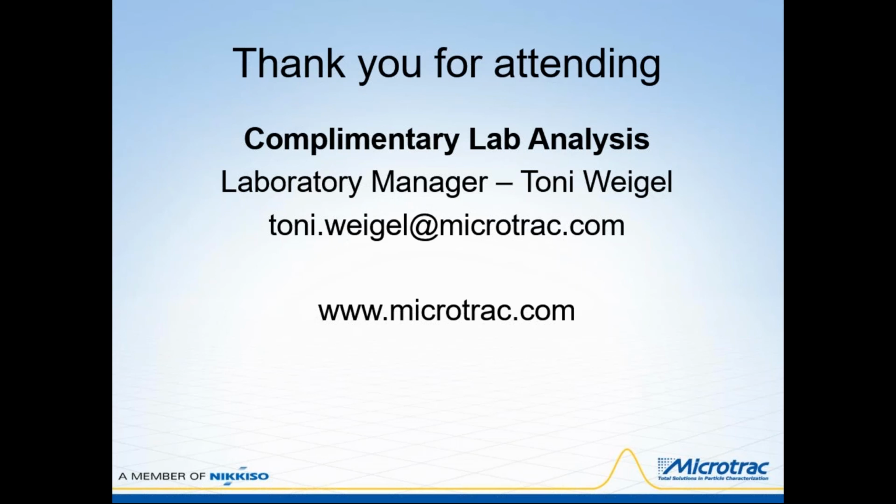Great, thank you. Our next attendee asks, what is the particle size range, the minimal particle size, that can be measured or analyzed? The minimum size on the PartAn 3D is 35 microns. This is a dry analysis instrument.